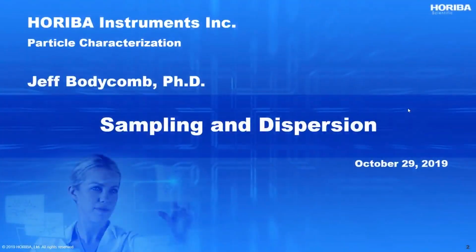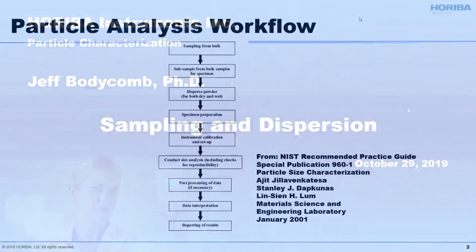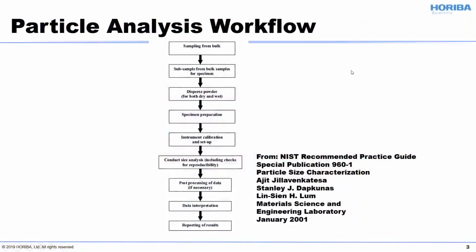Welcome, everybody, to a discussion about sampling and dispersion. I'm with HORIBA Instruments, in the particle characterization group, so we get very interested in this topic. The first thing I should mention, as an introduction, is the particle analysis workflow. There's a NIST recommended practice guide on particle size characterization, published back in 2001, and it goes through a lot of good topics, and one of them is this workflow.